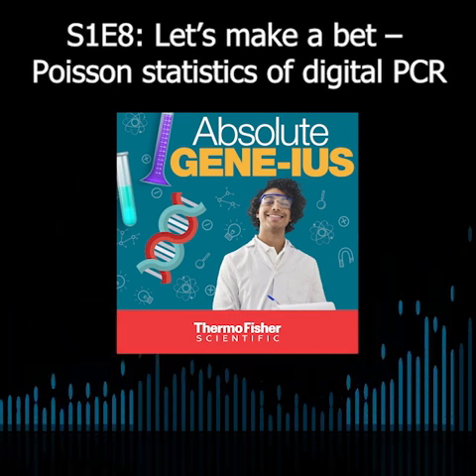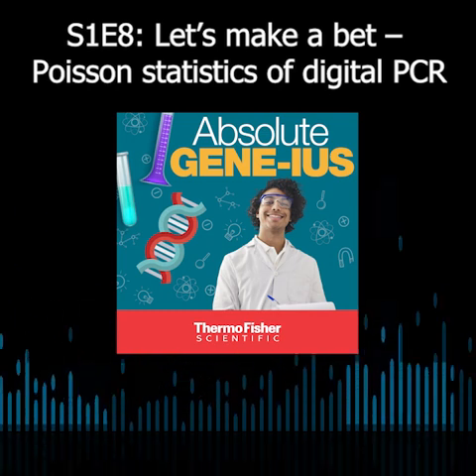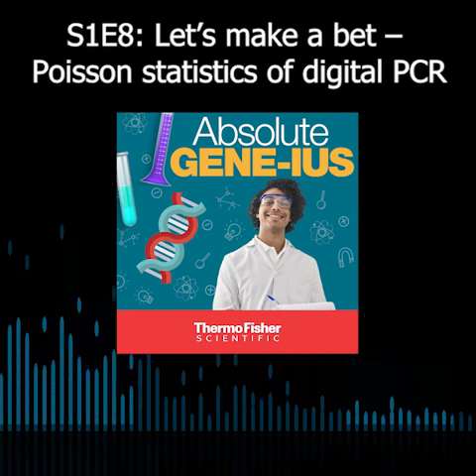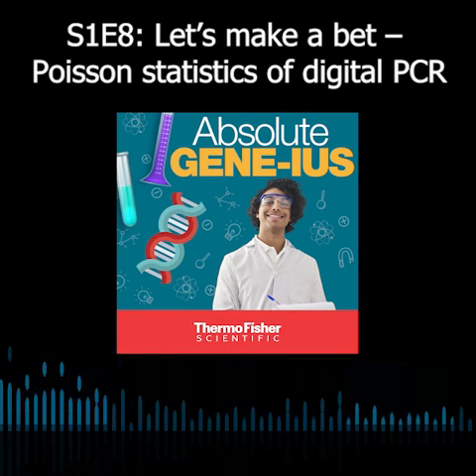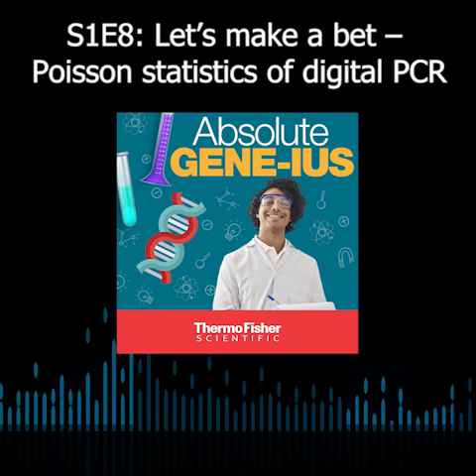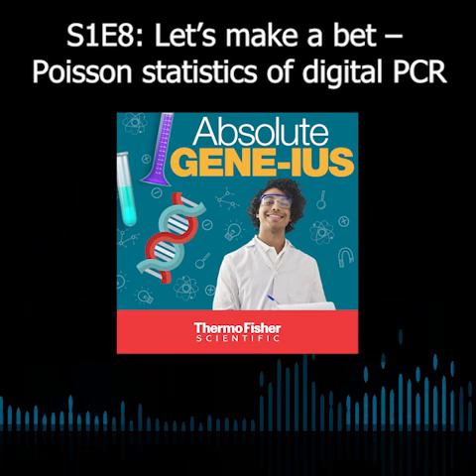Now, when you are actually looking at this and you're splitting your sample into those thousands of micro reactions, is it safe to say that every micro reaction will get one target and will truly have that one-to-one yes answer and one-to-one no answer, or is there something else maybe under the hood that happens there?